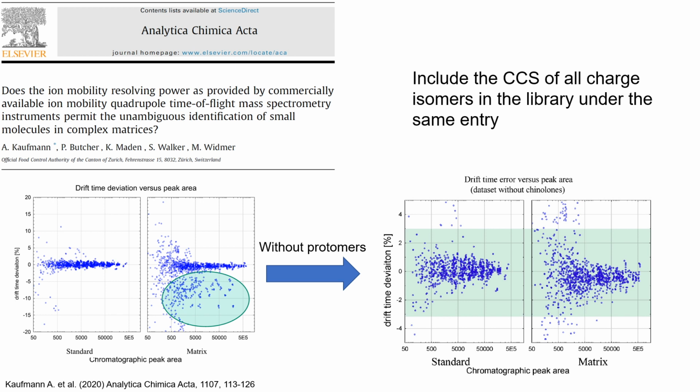If we combine the delta CCS filter with the mass to charge and retention time filters, then we gain an additional effect that will reduce the number of false positives and also the number of false negatives, and really increase the detection and identification power. From my experience, when the system is well calibrated and when we can afford to work at 10 or 5 ppm mass to charge, delta CCS below 2%, and we add also plus and minus 1 minute of retention time, if we have the retention time data, of course.